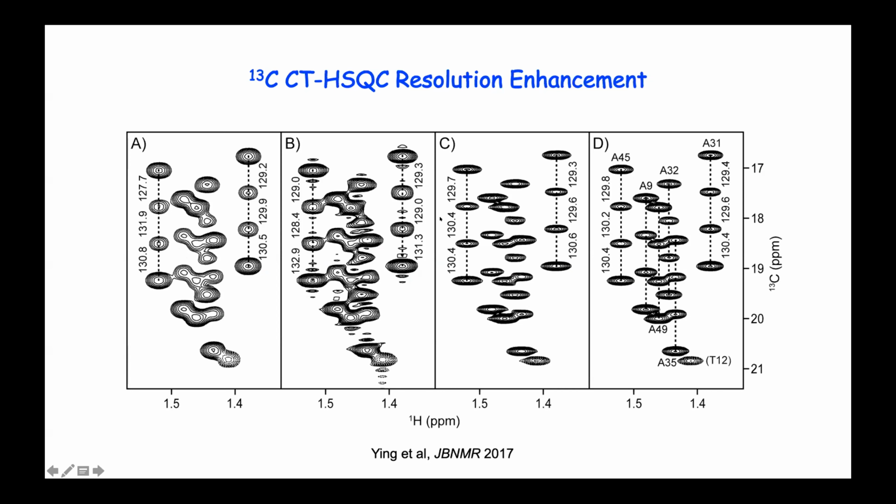So it's not doable. So in this case, we do 28 millisecond, and we try to extend it to 56 millisecond. And this is a 28 millisecond with a kind of cosine window applied up to 58 milliseconds. So part of the resolution enhancement is coming really from the more aggressive window apodization function that we use. And then you can consider these as the special non-uniform sampling artifacts that are cleaned up by SMILE. So that's one way of doing it.